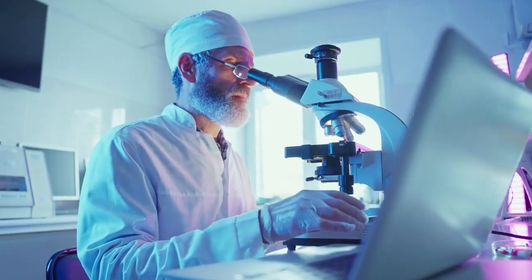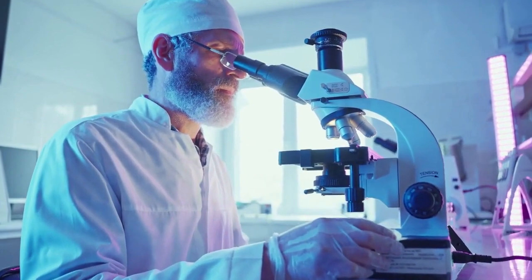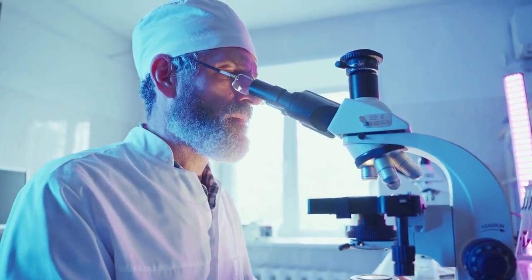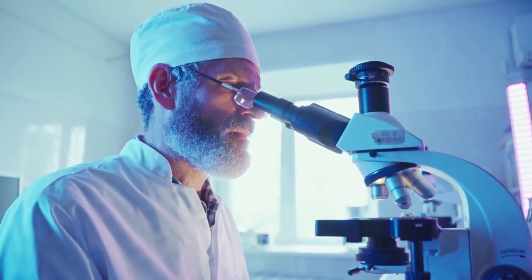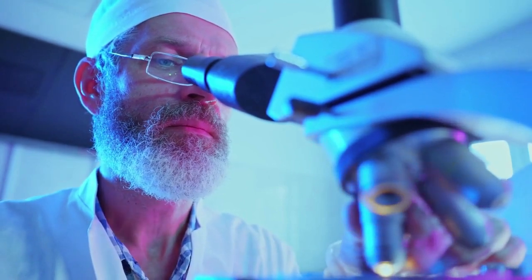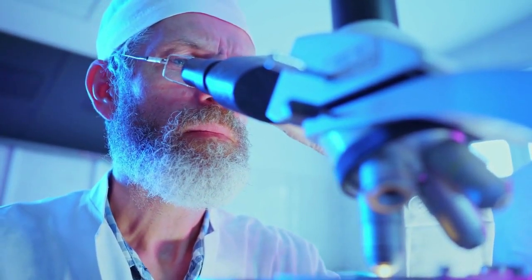In AES, we don't use an external lamp at all. The glowing, excited atoms in the sample are our light source. A detector then looks at the colors and brightness of the light being emitted. The brighter the light of a specific color, the more of that element is in the sample. So, AES is all about measuring the new light that appears.